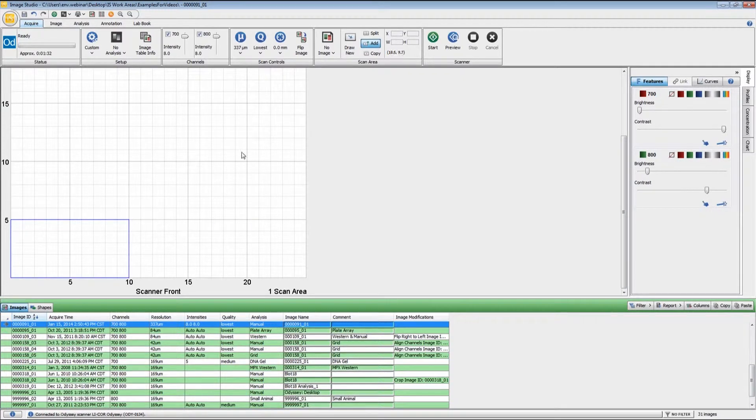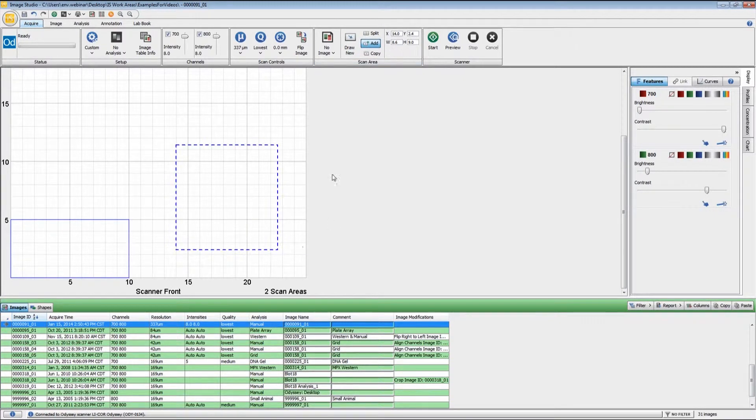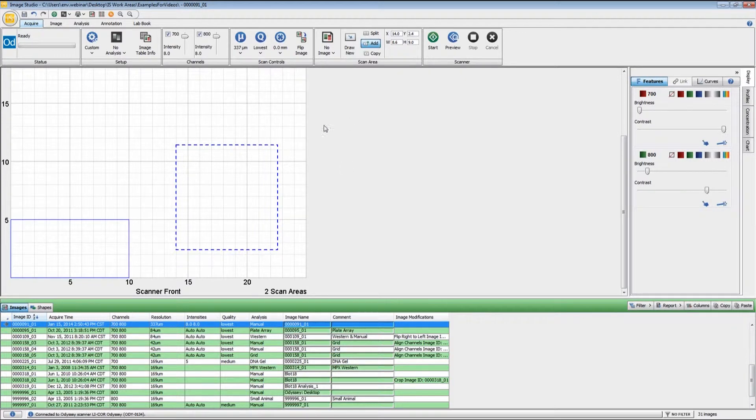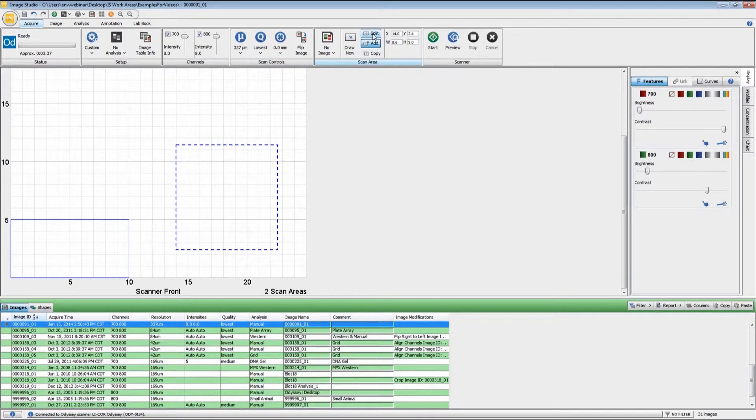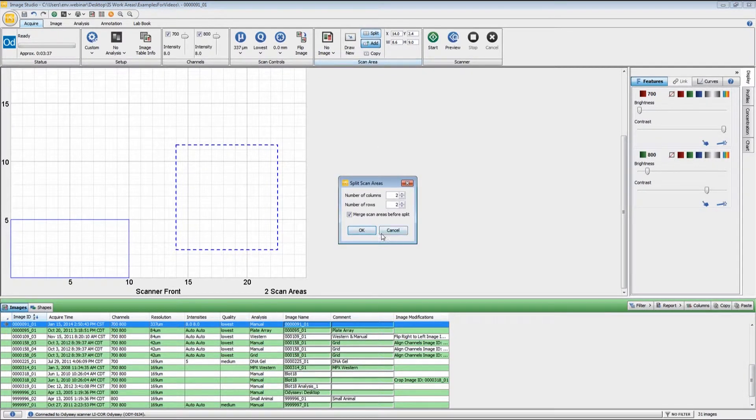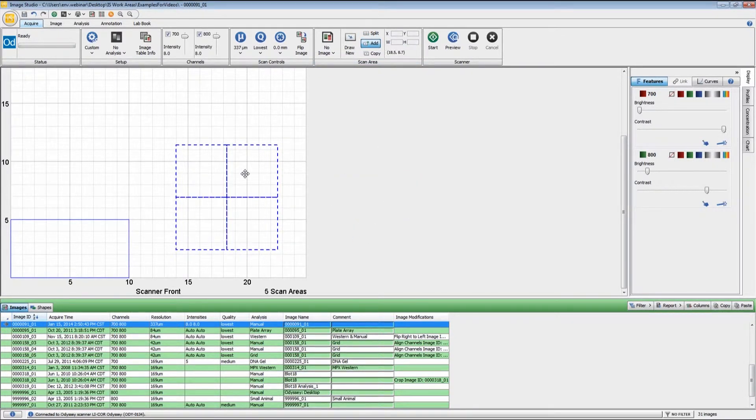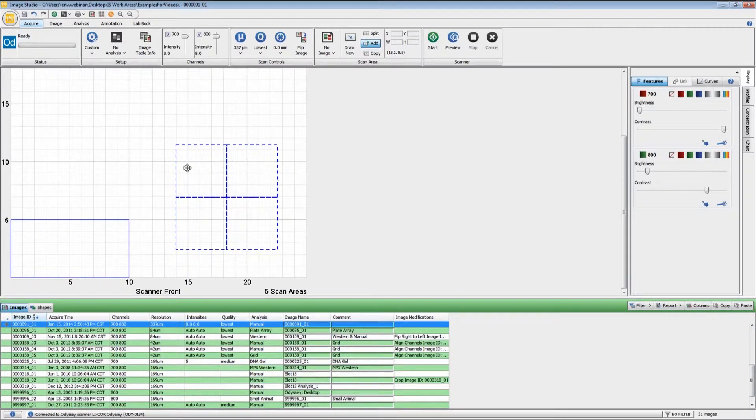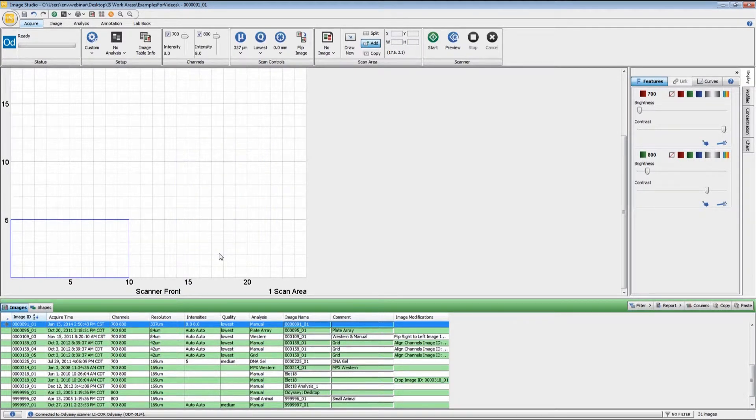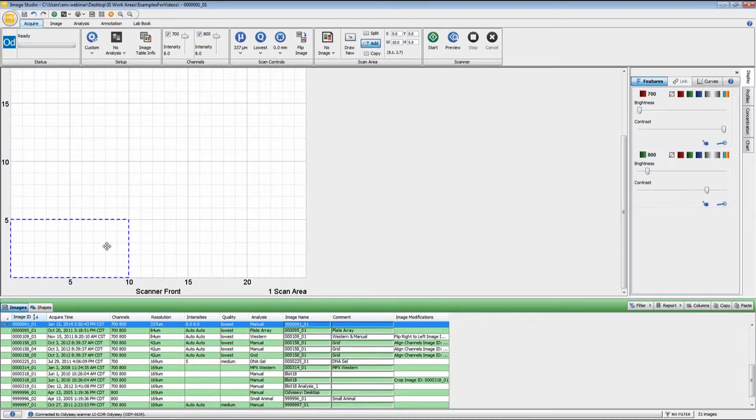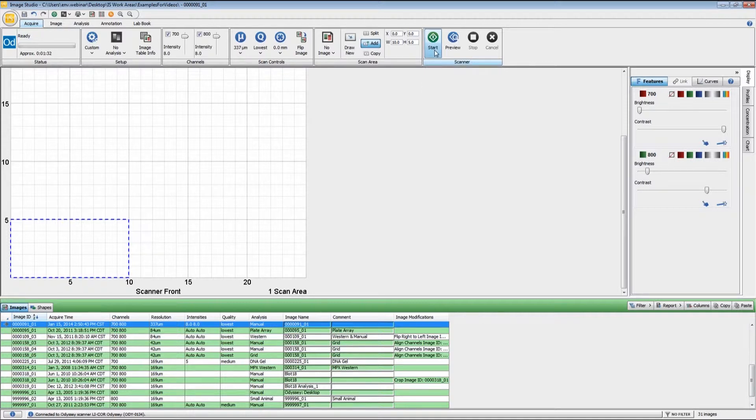If you have several blots that are approximately the same size, if I draw a box that bounds all of them, I can then split this. If I do a two by two split, now each one of these becomes separate scan areas. But since I only have one blot to scan right now, I'm just going to use this single scan area and press Start.